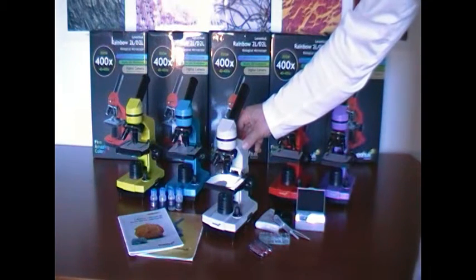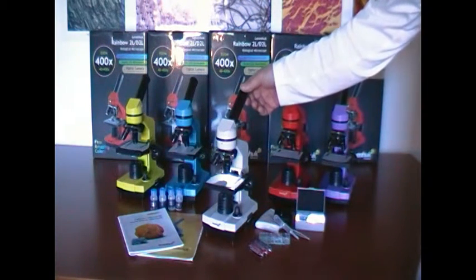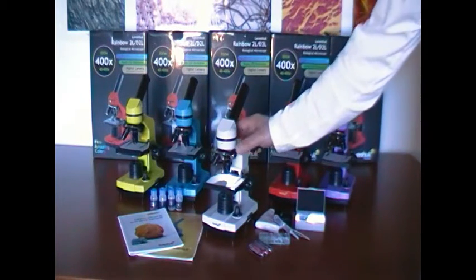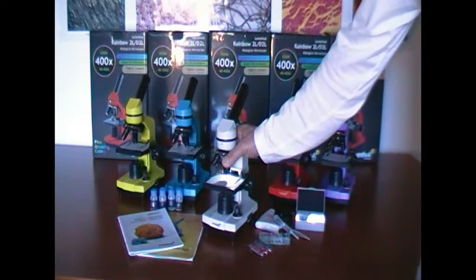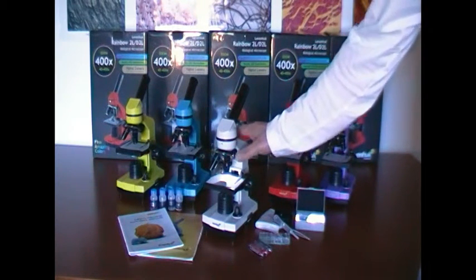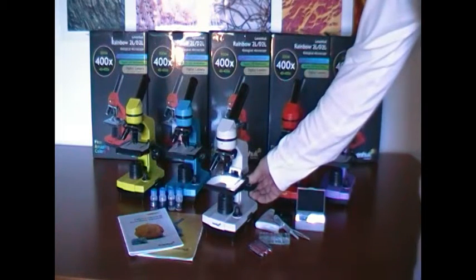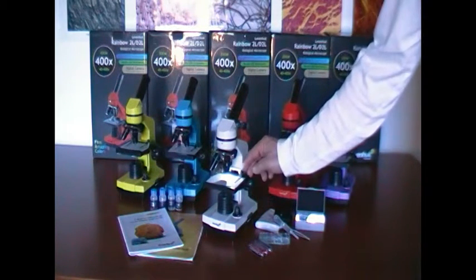This microscope has a durable plastic body. The eyepiece of the microscope offers magnification of 10x, and the revolving nosepiece includes objectives with magnification of 4x, 10x, and 40x. The stage is adjustable and equipped with clips.